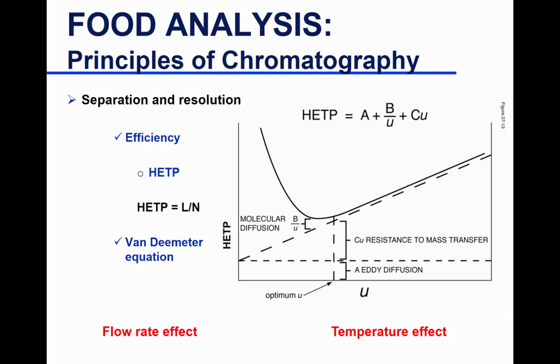The larger the N, the narrower the plates. That means you have a shorter height, which is good for resolution. As the height becomes bigger, you lose resolution, so this needs to remain narrow. I will talk more about what A, B, and C stand for and what they mean in terms of resolution. We'll start that on Monday.